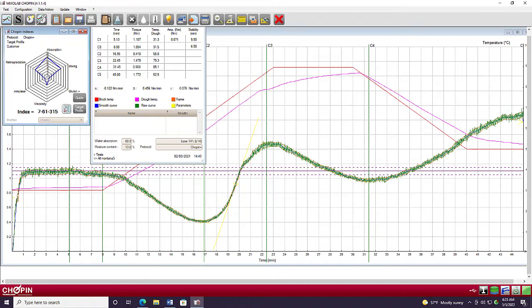Initial resistance to heating. So if we look at this portion of the curve, this can be summarized by this parameter right here, which is the slope of that portion of the curve. It's really an indication of the volume increase that you might expect to see during baking. So how does heat affect that gluten and does it affect it in a way that's going to allow for a nice oven spring? That's right.